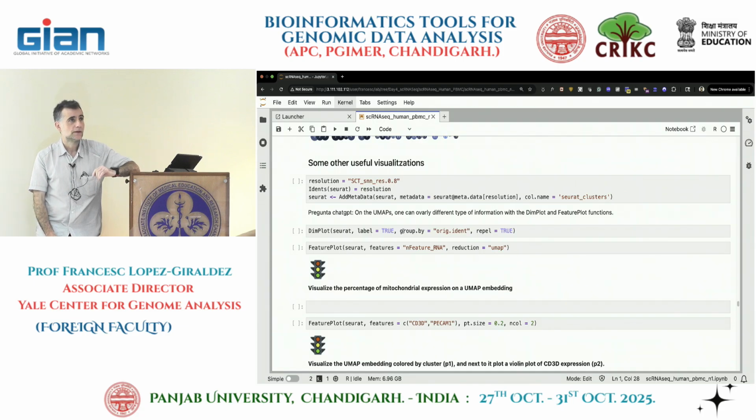There are people who sort cells, and then you already know what cell type they're working with, and they only care about whether they're expressing some specific gene. They work with retina. I remember people working with some type of retina cells, and they do a knockout, and they want to know how specific cells react to the knockout. So then the question is different. But generally there's going to be some clustering, that's true, but not necessarily are you going to be defining cell types per se.